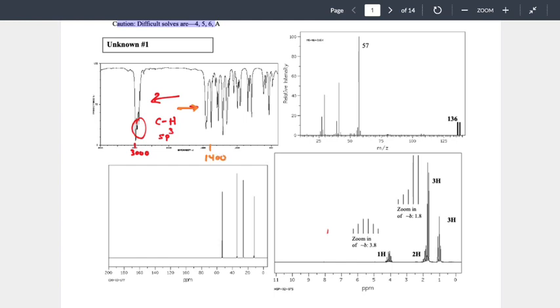Typically, what we would reference is anything 1400 and lower is what's known as the fingerprint. When you go to meet someone new, you might ask what color shirt they're wearing, how tall they are, so that when you meet them, you know who they are roughly. But are you looking at their fingerprint? Their fingerprint identifies them better than that, because if we said black shirt, who are we talking about? There's 3 people with black shirts in here. So maybe we need to use fingerprints to figure that out.